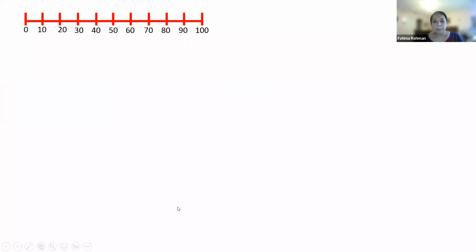There. So this one up here is your ocular micrometer, right? This is what you see in the eyepiece, right? And if we were to look at it, each one of these is gonna be further subdivided into five, 10, right? So each one of these lines is an ocular unit, or OU for short, okay? So it's divided into 100 ocular units, OU for short, okay?